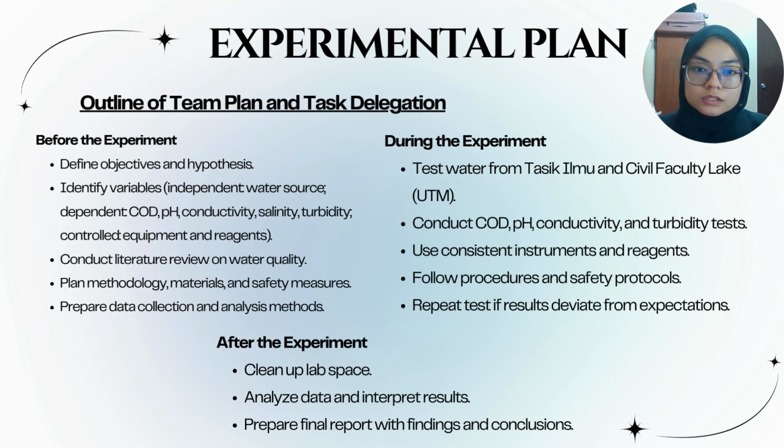So during the experiment, we have to collect the water sample and test the water sample, also conduct the COD, pH, conductivity, and turbidity tests for both of the water samples, following the procedures and the safety protocols. So we will repeat the test if the results are not accurate.